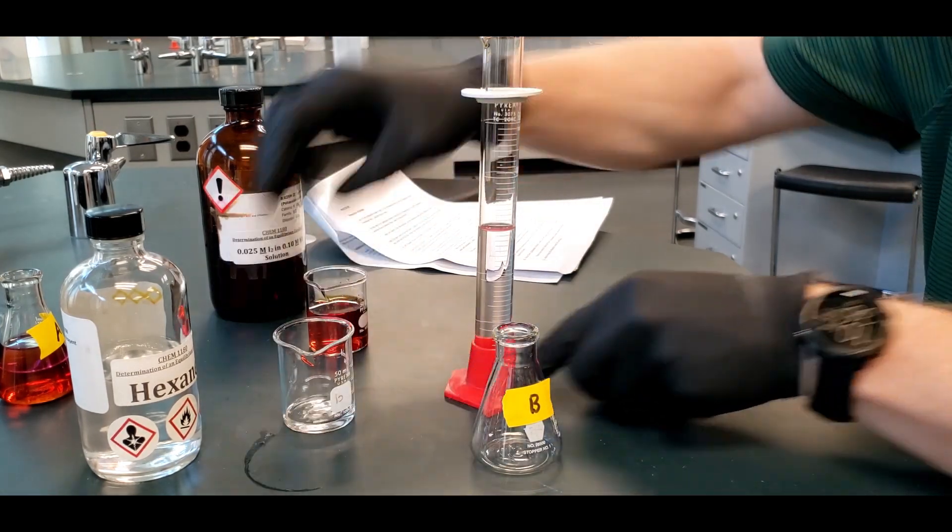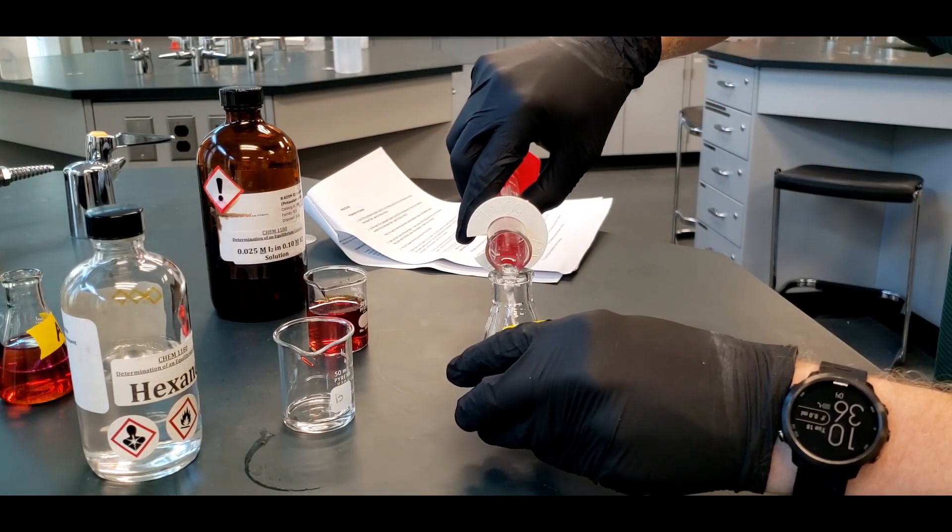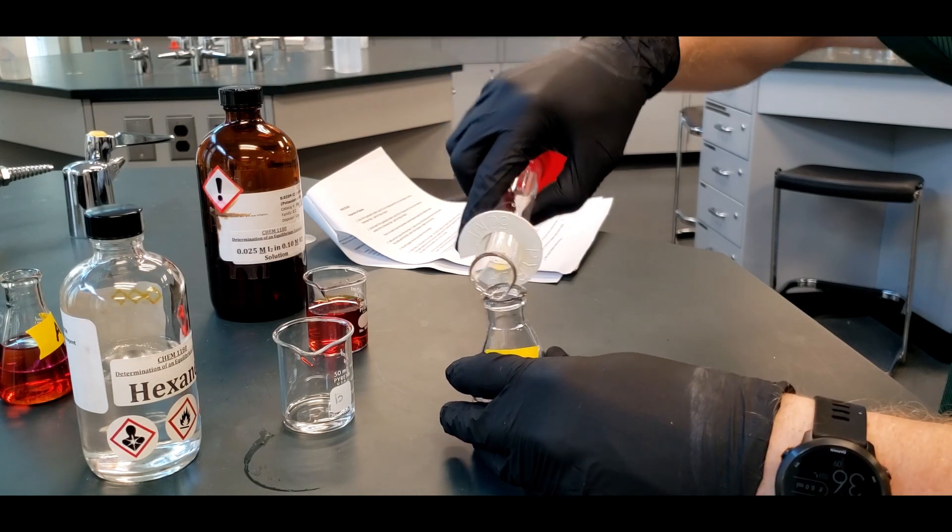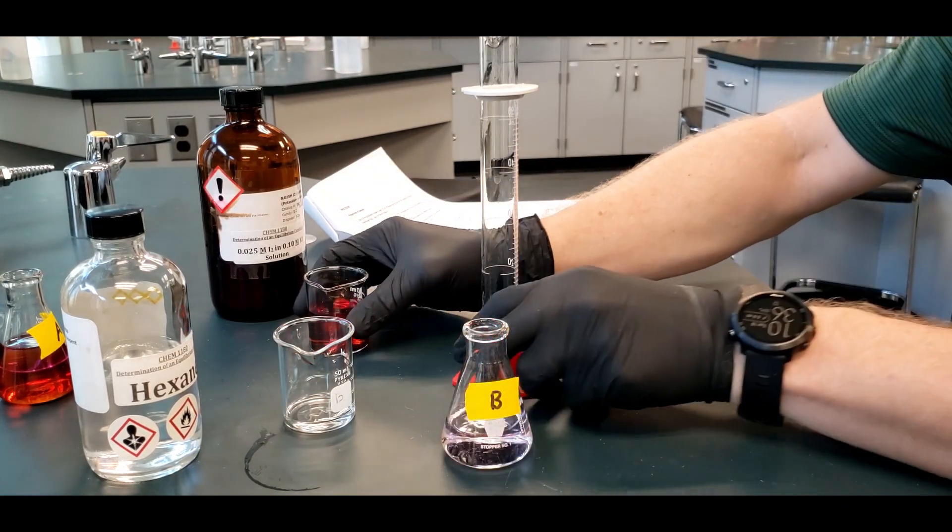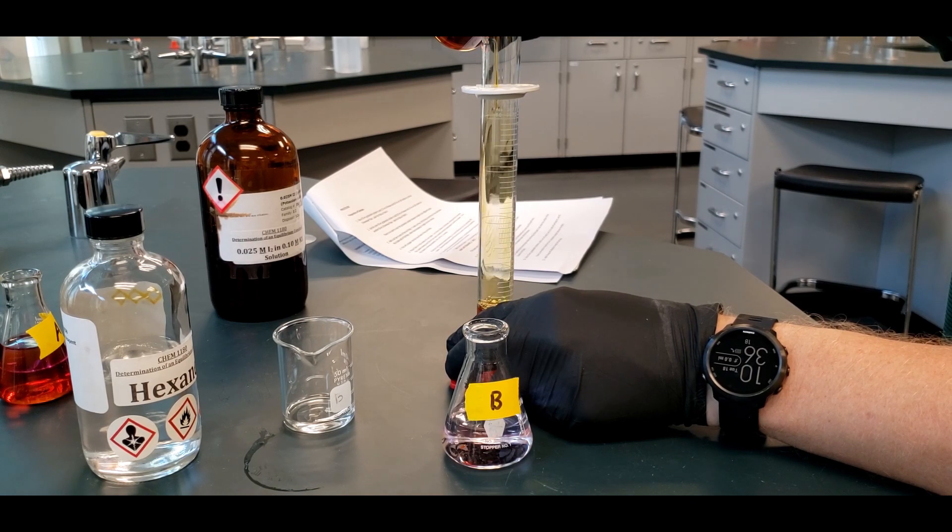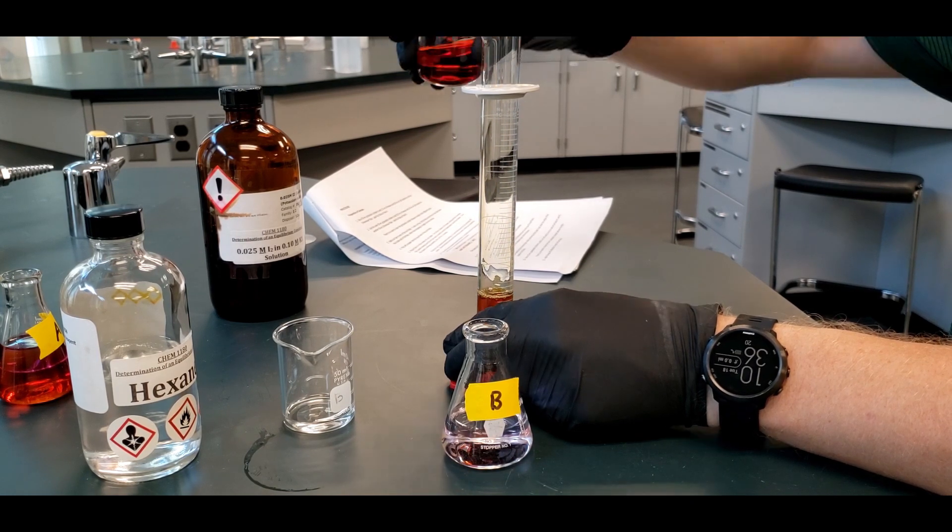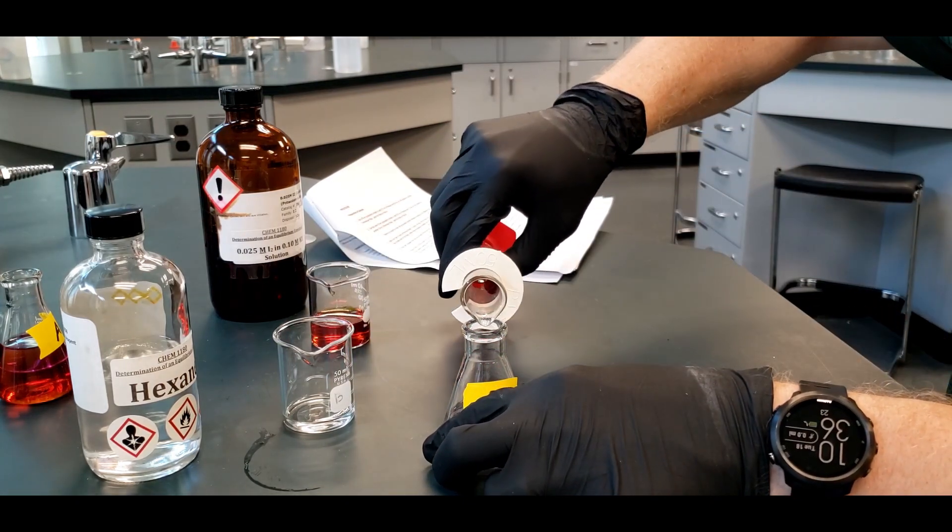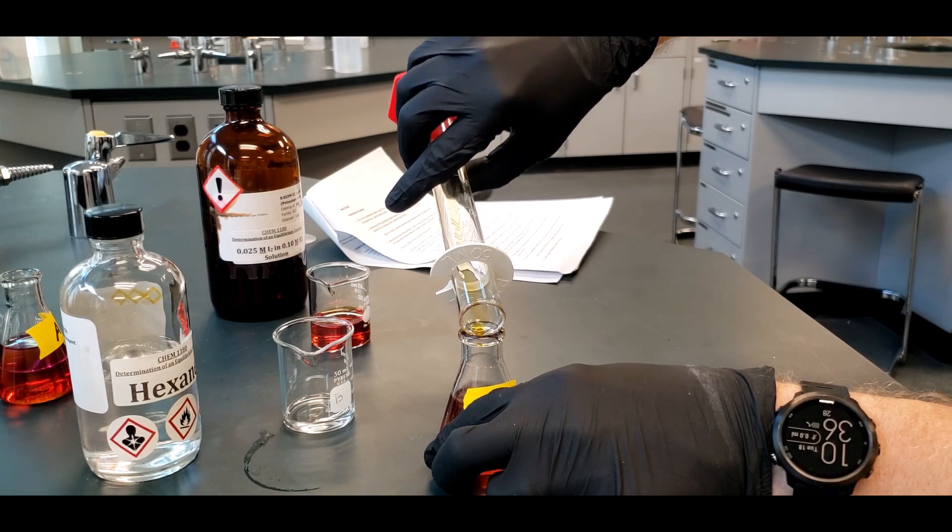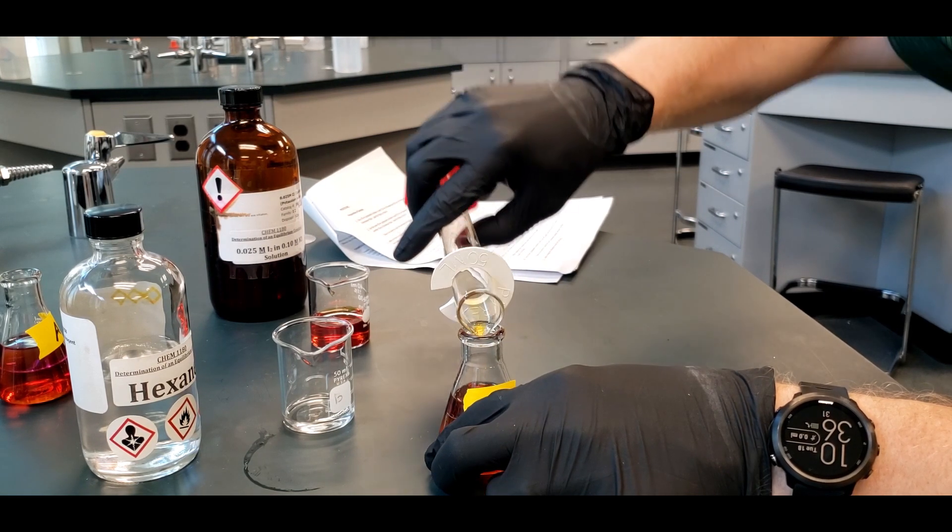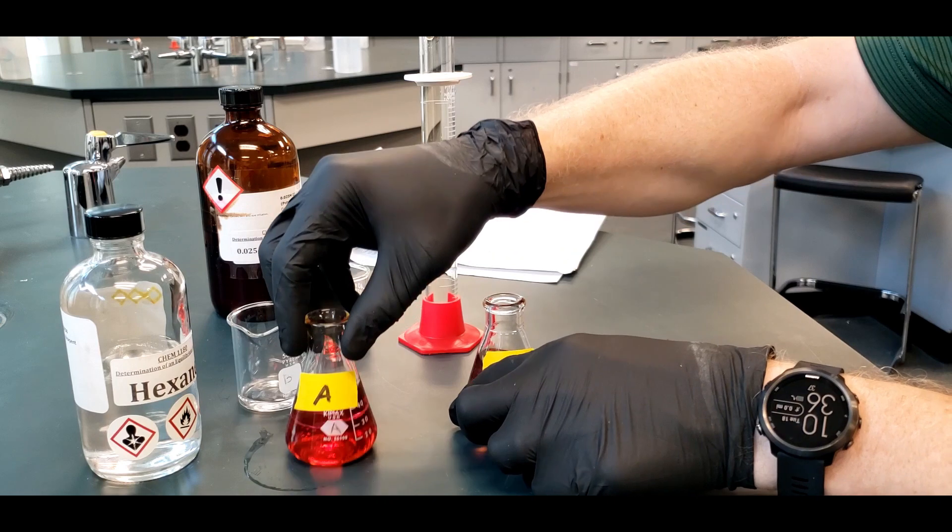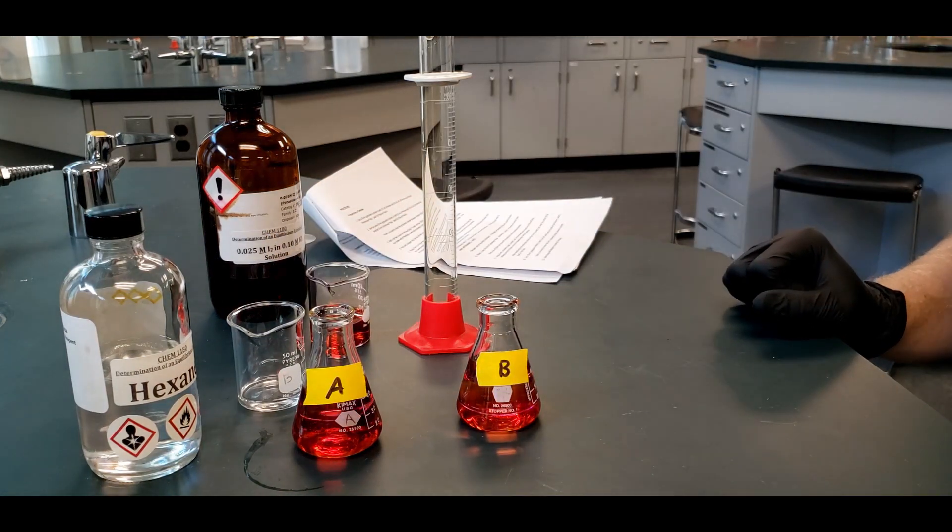So this is going to be 30 mL of the hexane. And as I said, you don't have to wash this out. A few drops of the solution that's left behind is not going to affect anything. You can see it's a little tinted because there's some of the iodine left in there. So we have our two mixtures, A and B, and we're ready to go on to step three.